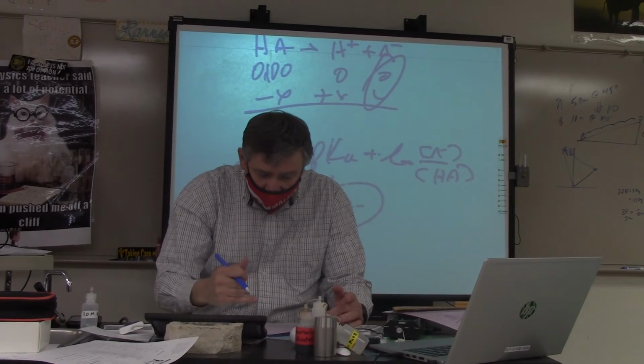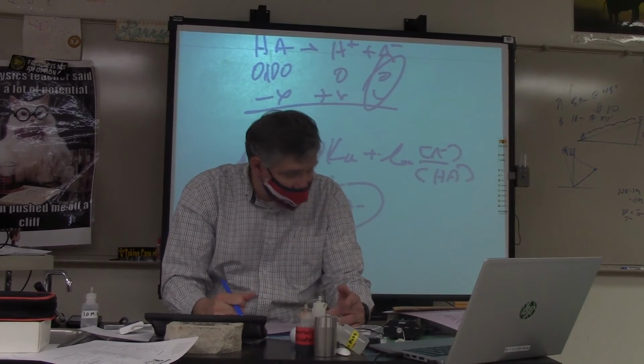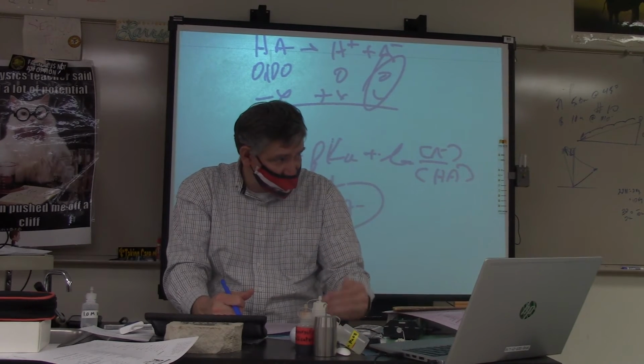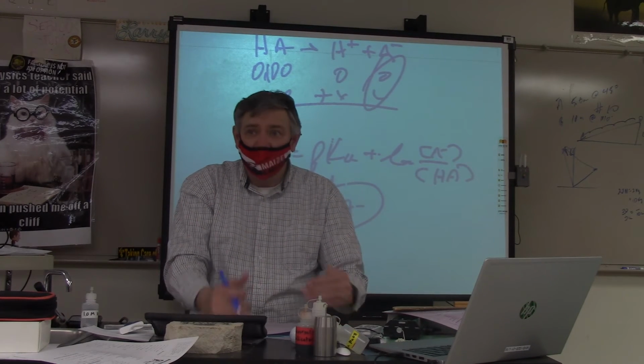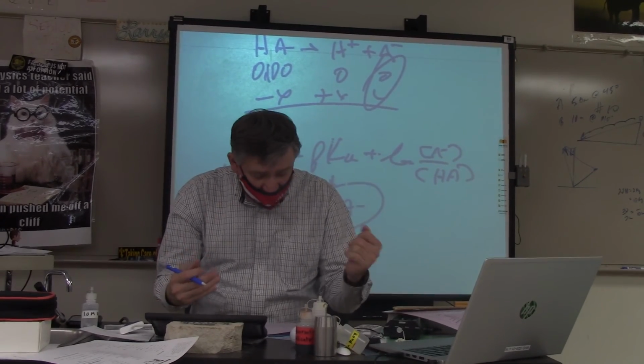So make sure when you hit 5, 6, and 7, and the same thing is up there on 1, 2, and 3, that you keep track of which solution you're dealing with, okay? Because that was the whole point of titrating 3 different solutions.